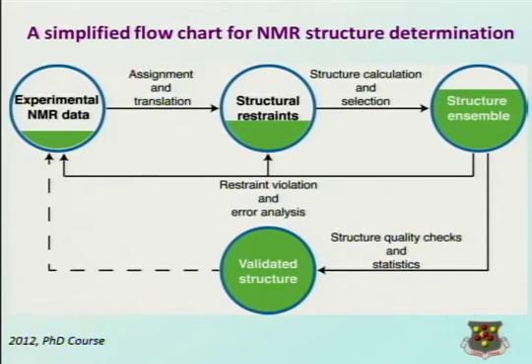So it's either protein or nucleic acid structure determination, or possibly adducts thereof. But talking about complexes will be the topic of tomorrow mainly. And all of my examples are from protein NMR work, because that's the specialty of the lab.